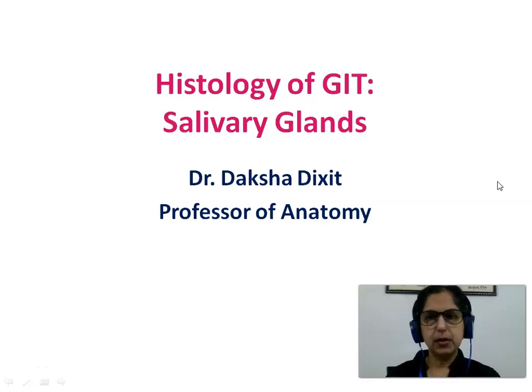Hello students, today we will be studying the histology of the salivary glands. Now in this video we will first be seeing the general structure of a gland, the duct and the acini, and then we will go on to study three important exam slides of the salivary glands. That's the serous gland, mucous gland and mixed salivary gland.